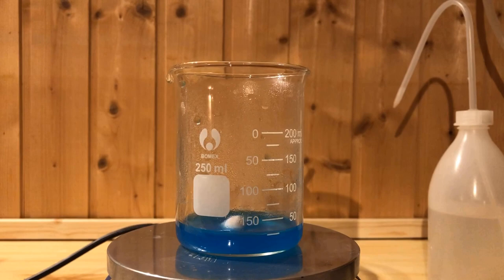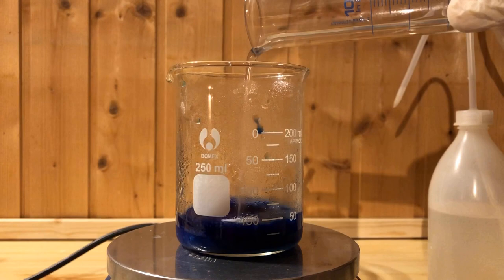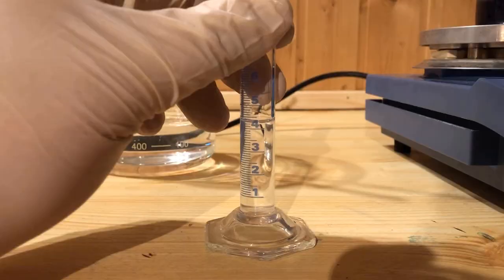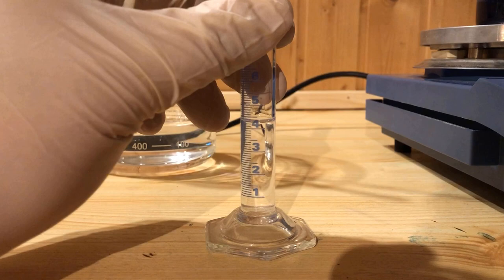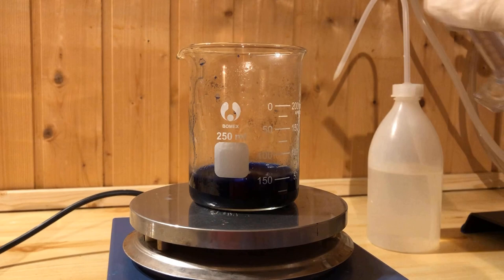After the solution has cooled, 20 milliliters of 25% ammonia solution is added. 4.3 milliliters of the prepared sodium hydroxide solution is measured in a graduated cylinder and also added to the solution.